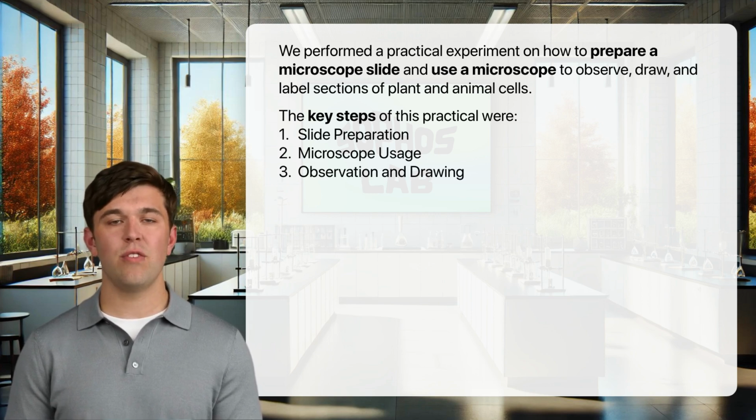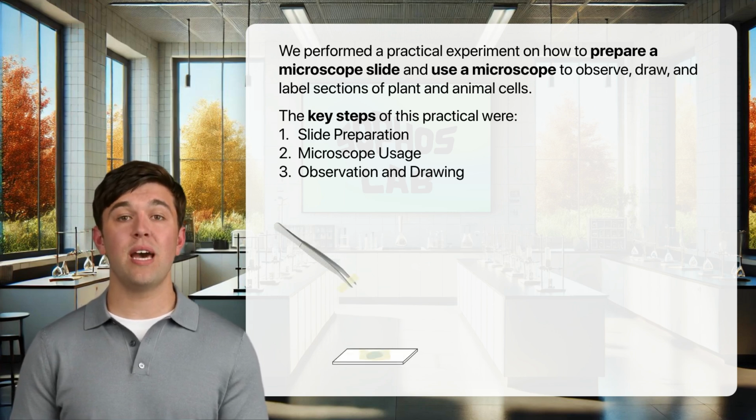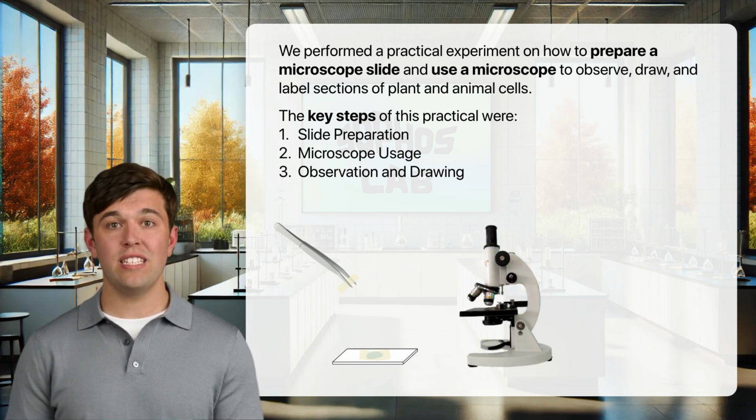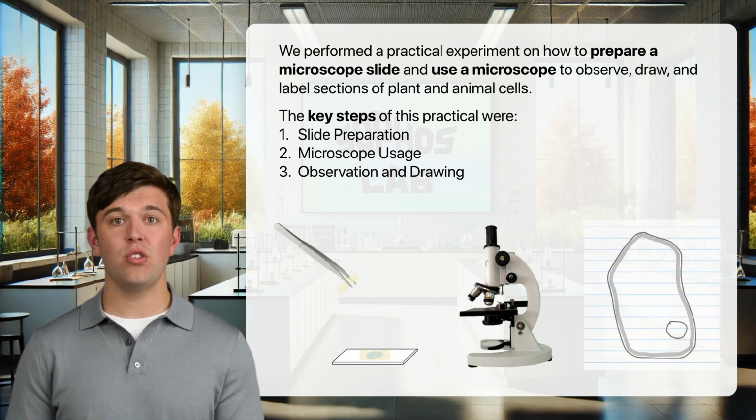Our key takeaways for future practical are to handle specimens and stains with care to avoid contamination or damage, use the microscope correctly to obtain clear and detailed images, and accurately draw and label cell structures as part of scientific documentation.